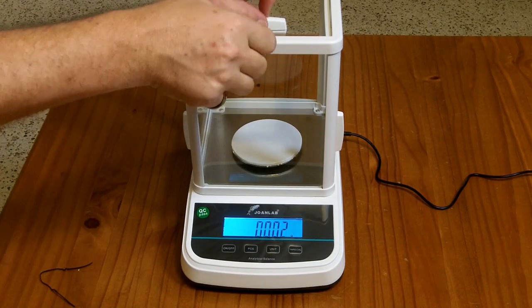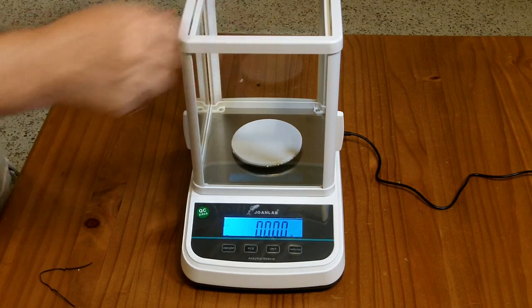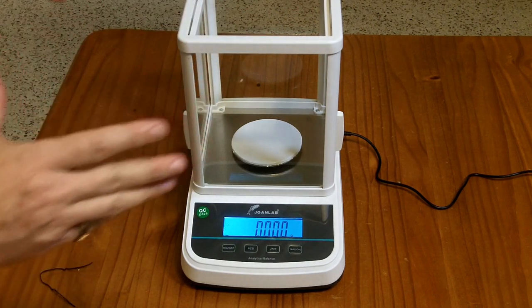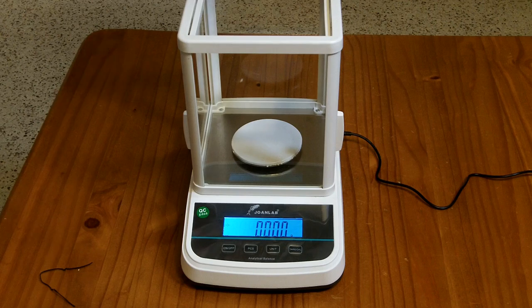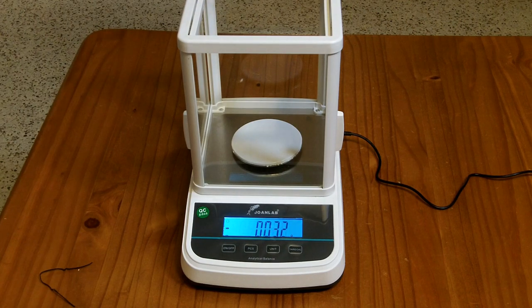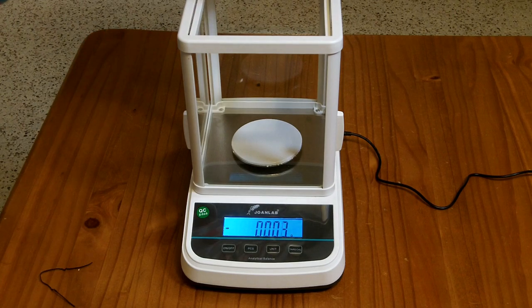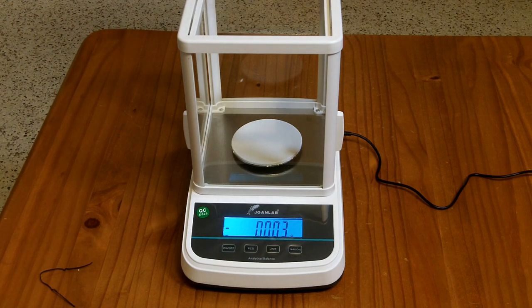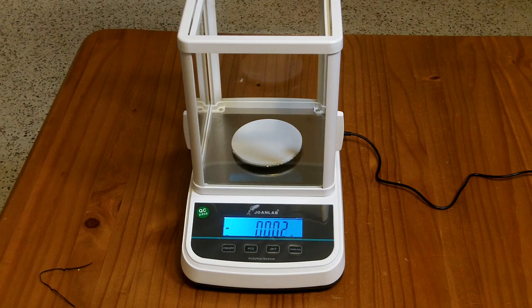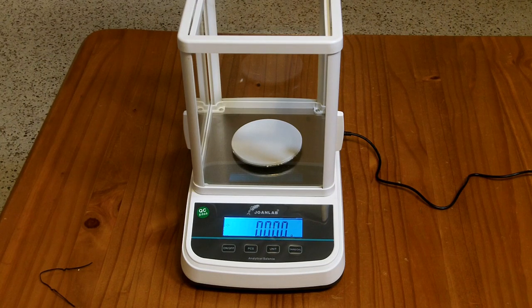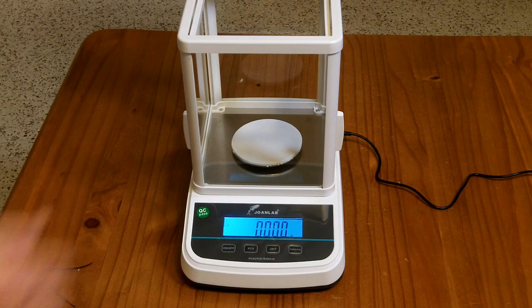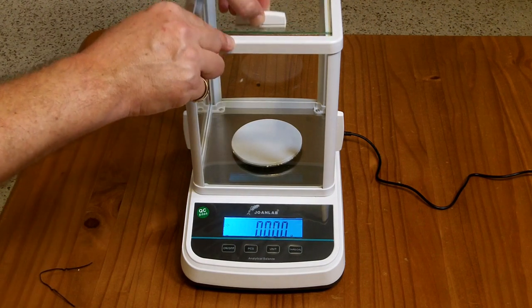Now in case you're wondering, hey, why is there this sliding window or why is there glass around the whole thing? When you blow on it, the weight changes. So if you have an air conditioner vent nearby or anything like that, or just people walking by or anything that makes air movements, this glass protects it from those air movements.